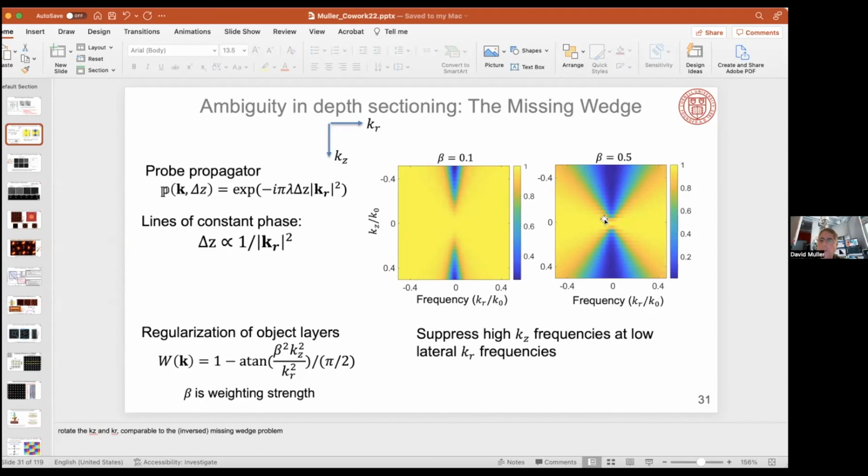It's a difficult thing to do at atomic resolution because you have to align everything to 1/10 of an atom in precision, and your mechanical stage runs out over microns. So we're working on trying to do some 3D reconstructions. We haven't got a good one at atomic resolution yet. But at intermediate resolutions, I think it would be a very dose efficient form of imaging, because if I can drop my number of tilts by a factor of 10, that's a big deal.